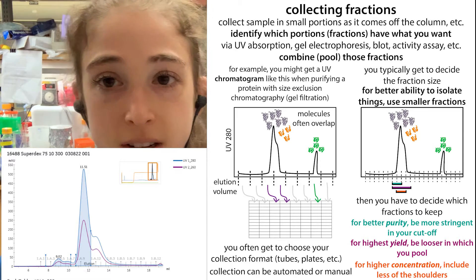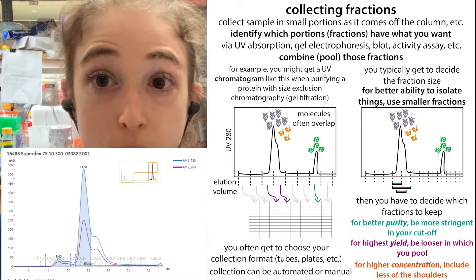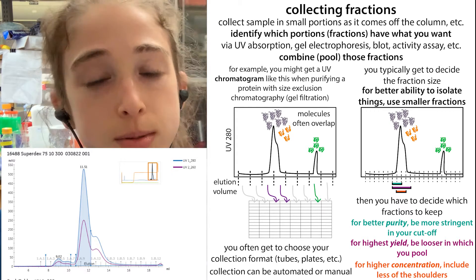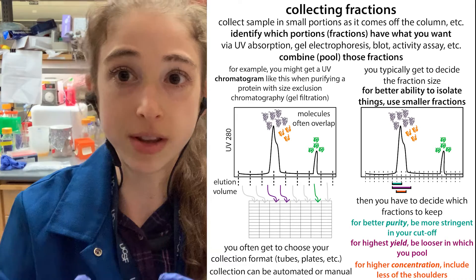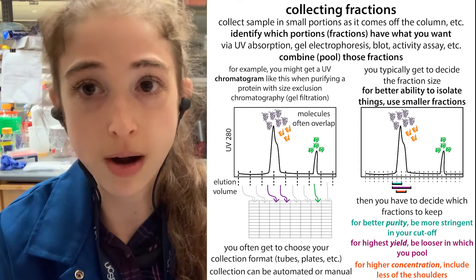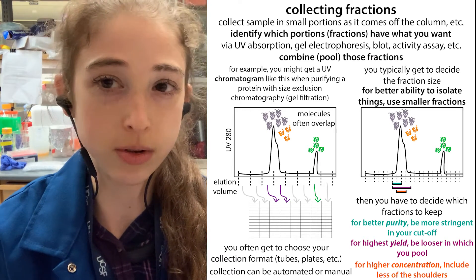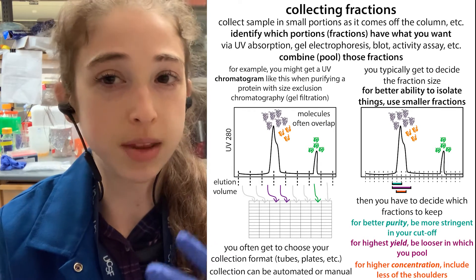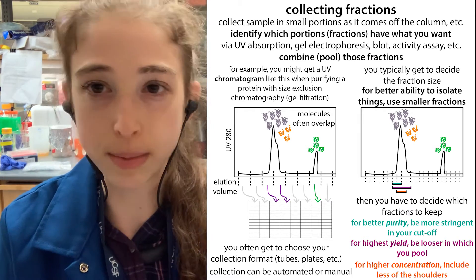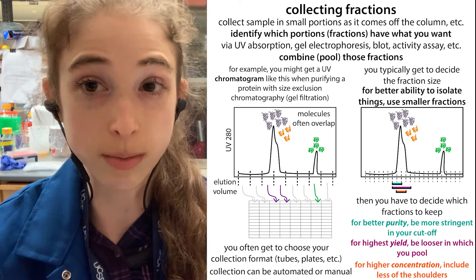If you have a peak on the front shoulder, it could be something like aggregation, dimerization, or potentially if you haven't cleaved your tag off the protein, it could be the tagged version. It all depends on what sort of separation method you're using. We could be separating based on other properties — things that are similar in charge if you're doing ion exchange chromatography, or polarity with HPLC — various methods where you're separating things and looking at the chromatograph and trying to determine which peaks to take.